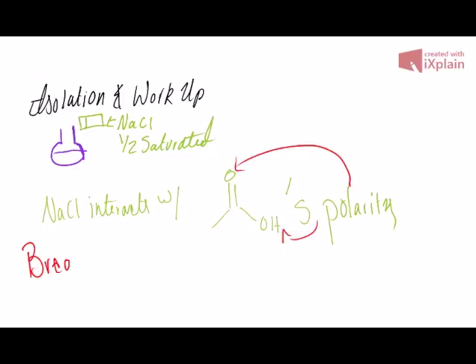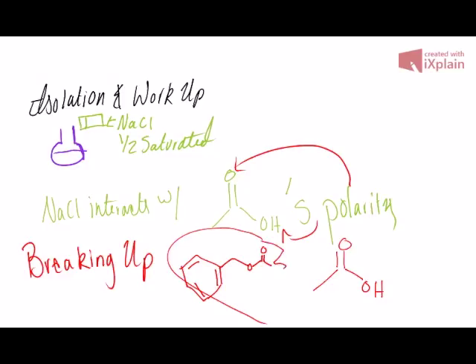Sodium bicarbonate was added to the substance to neutralize the remaining acetic acid. The neutralization resulted in the formation of water, sodium acetate, and carbon dioxide. The top waste layer was then discarded. The sodium chloride washes were then repeated from the beginning.